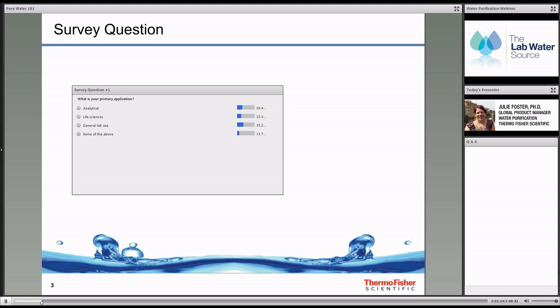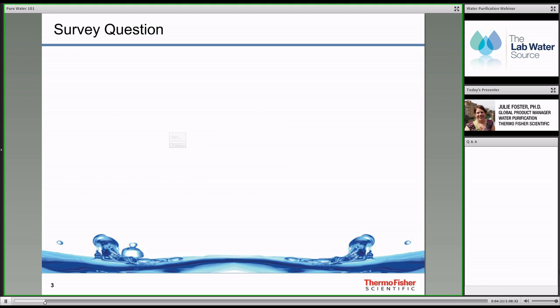Thanks, Jeff. All right, so we're pretty evenly split: analytical, life science, general, and then we have some none of the above. Not too surprisingly, the analytical and life science are definitely on the more sensitive end of the spectrum in terms of applications that you might be doing. And general lab use, normally every lab will need some water for general lab use, but we'll get into that in a minute.